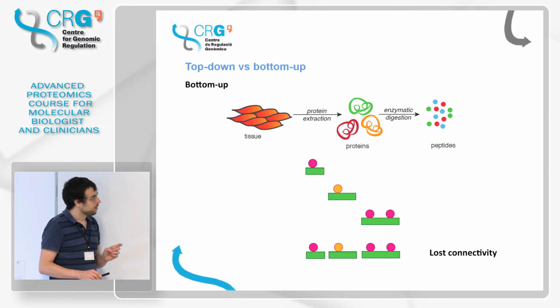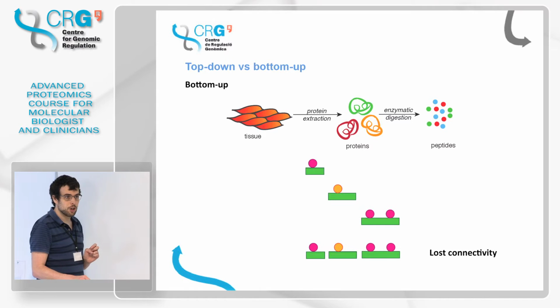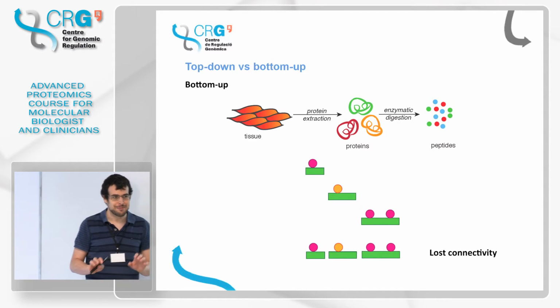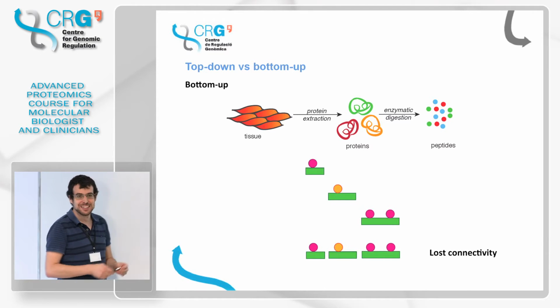But actually, we don't know whether these are present together in the same protein molecule or not. Okay, because we don't know. Yes, we lost connectivity. Is this clear? I didn't explain it very well, but it's very important.